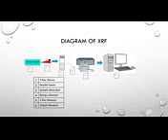This is an instrumental diagram of an X-ray fluorescence spectrometer. The X-ray source is an empty chamber with a heated cathode, usually made of tungsten wire. When the electrons are heated by the cathode, they are released and accelerate towards the anode.